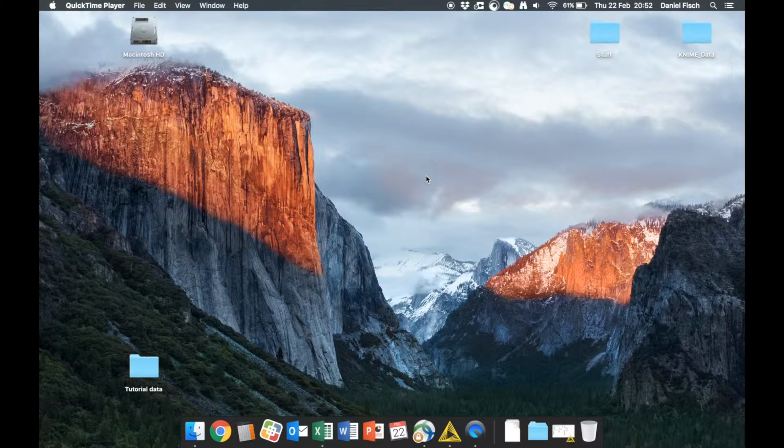Welcome back to the series of HRMAn tutorial videos. In this video we'll show you how to actually use the analysis pipeline itself. If you're interested in setting up HRMAn and training it, you can watch all the other videos that you can find on our homepage HRMAn.org. This video is going to have two major parts based on the two different analysis types that are currently available in HRMAn.